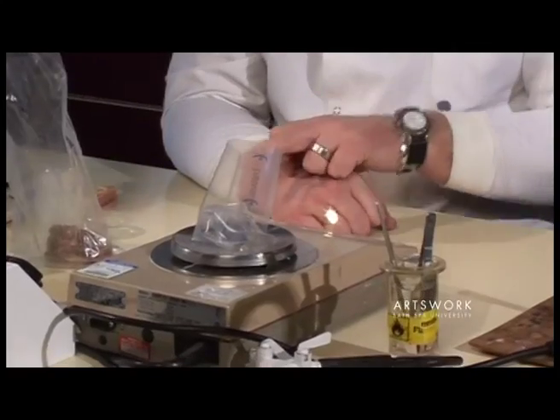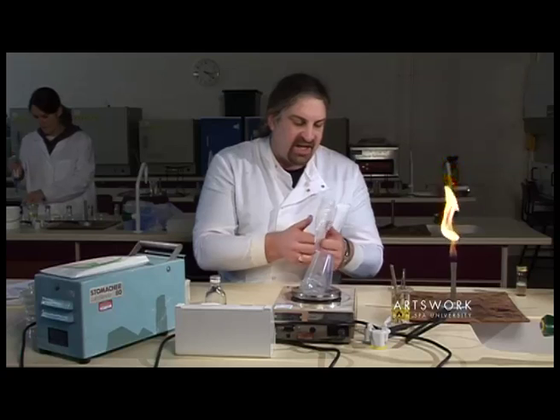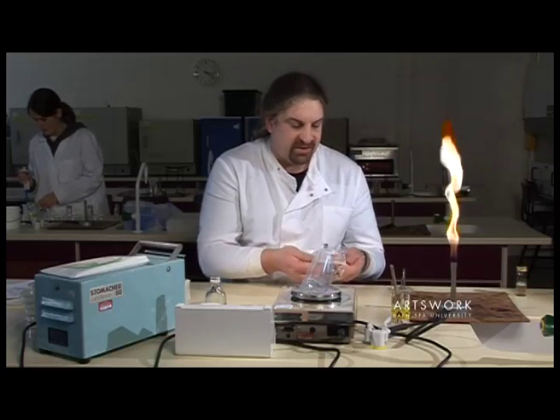Make sure that you zero the balance, because what we want to do is to add in five grams of our sample.